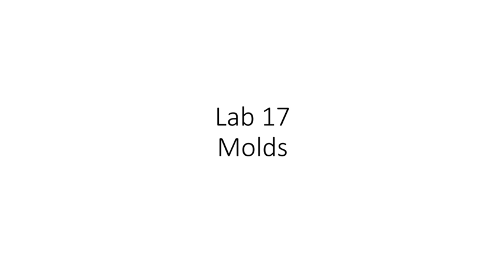And there's not a whole lot that I can say to introduce this lab because this is a lab where you are going to be tasked with solving a mystery, which is what species of mold have you been provided? There are 8 different species of molds that are the possible species that you will be provided, and all of those are outlined in your lab activity, so make sure you thoroughly read the background of your lab activity.